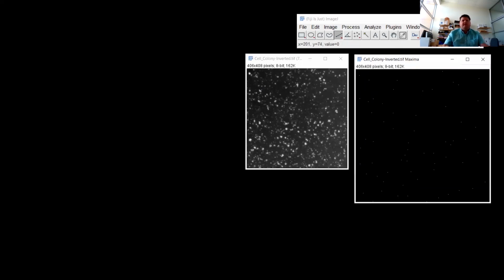As an example, I've used this method when we get really densely packed nuclear stain in tissue, and people want to see if their single cells are lighting up with their GFP marker or something in that tissue. It's quite hard to threshold those really densely packed nuclei, but you can blur it and you'll get little undulations in the intensity, and you can define what above background would be and get these points.